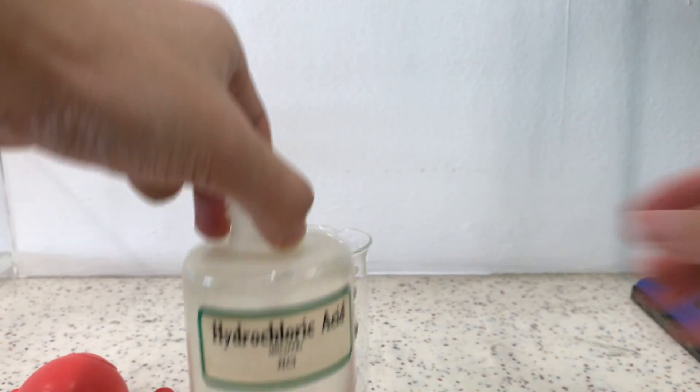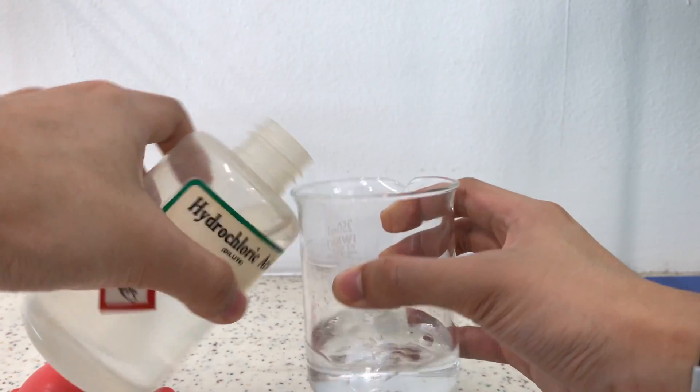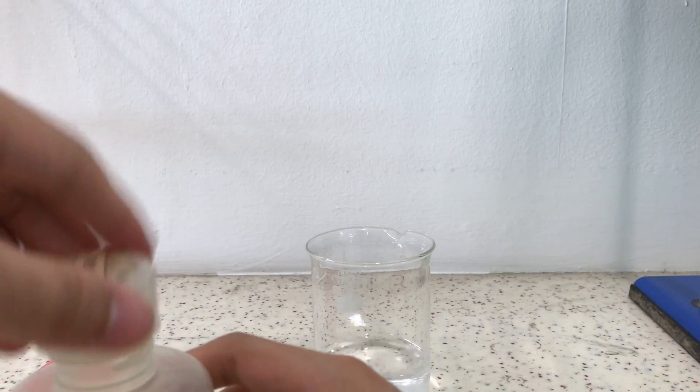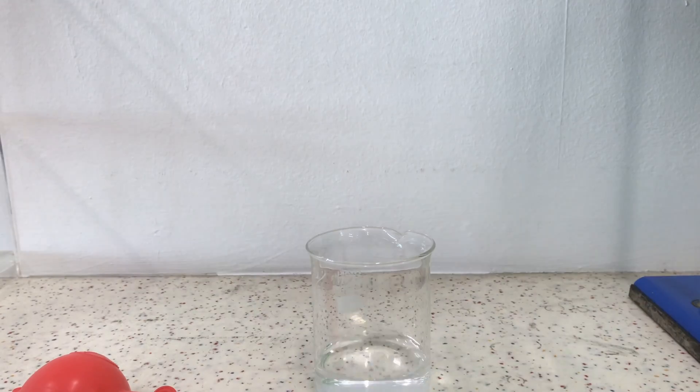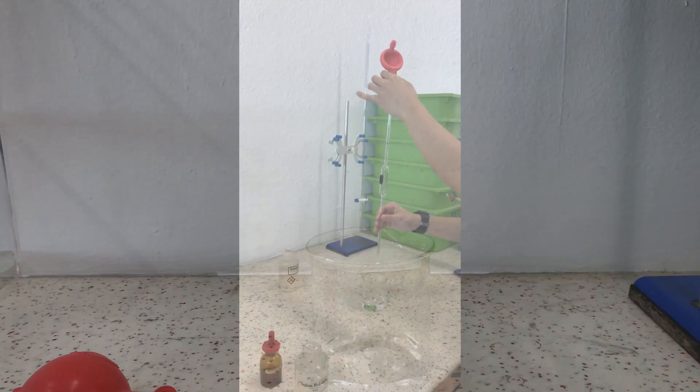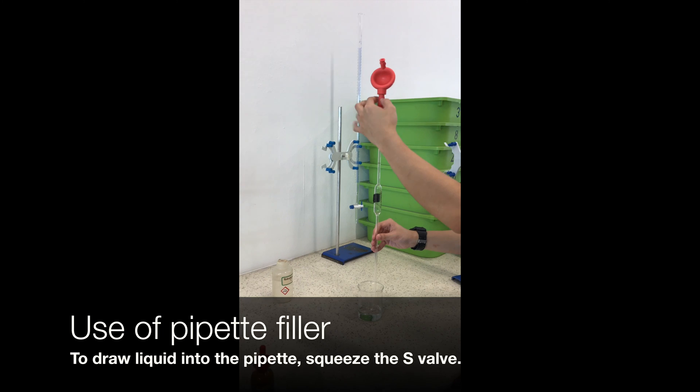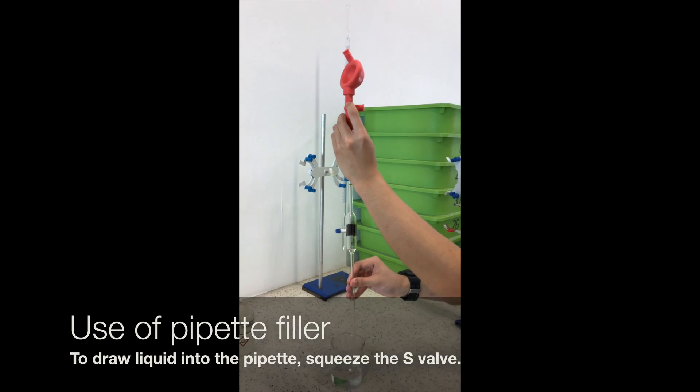Let's say we want hydrochloric acid to be placed in the conical flask. We will put some into the beaker first. And to draw up solution into the pipette, we press the S button which stands for suction.